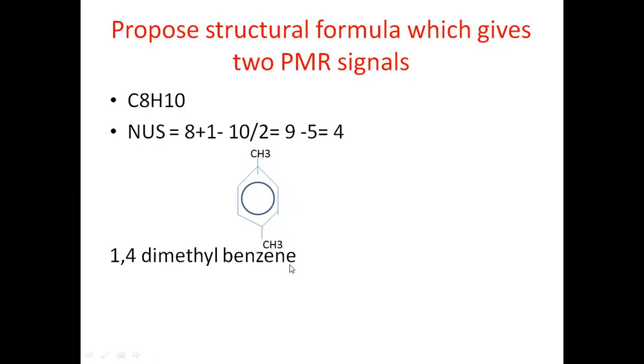1,4-dimethyl benzene will show two PMR signals.